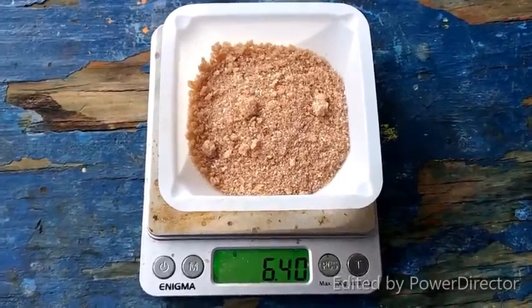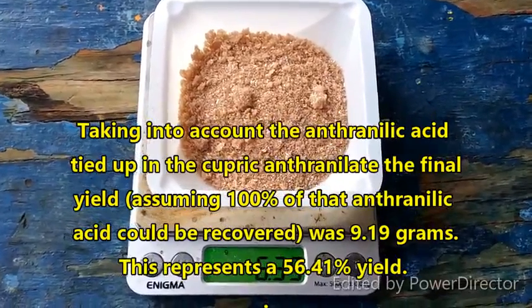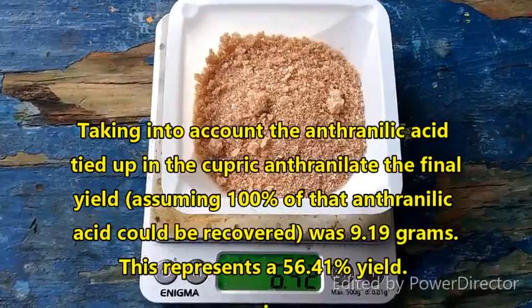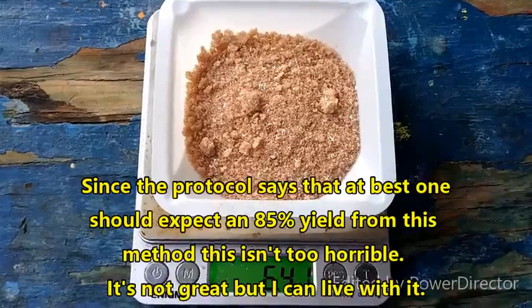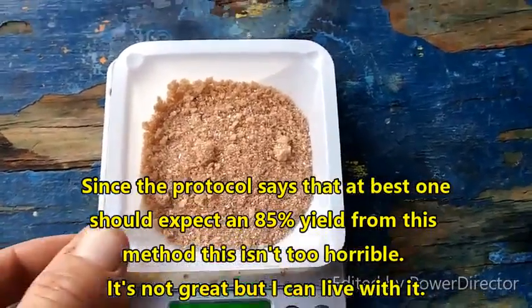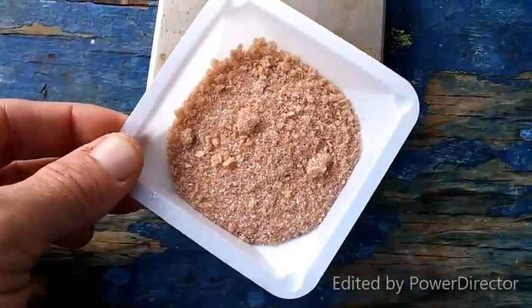Alright, everybody, so this is my final dried recrystallized product. As you can see, the weight is not that great. The yield was kind of crappy. The color still isn't fantastic, but it's acceptable. It is, however, very light, very fluffy, very sparkly. So, I mean, it's definitely beautiful.